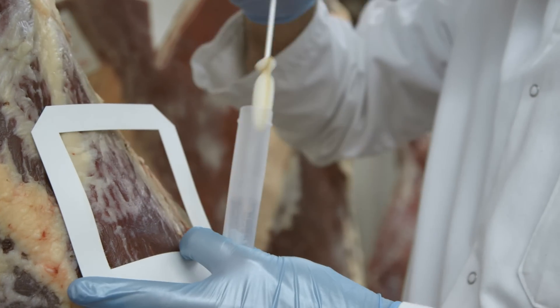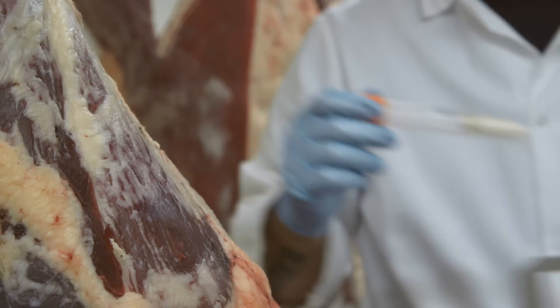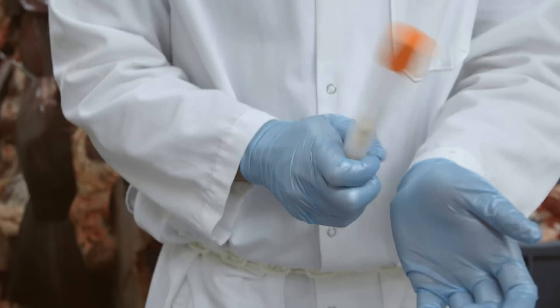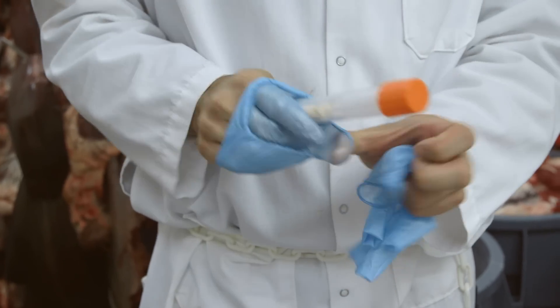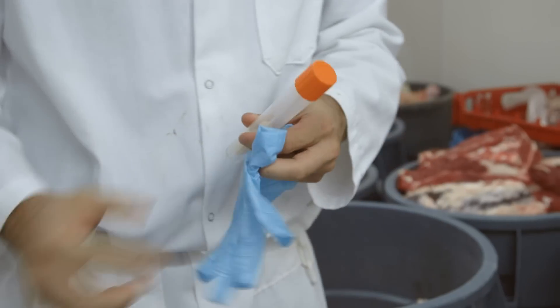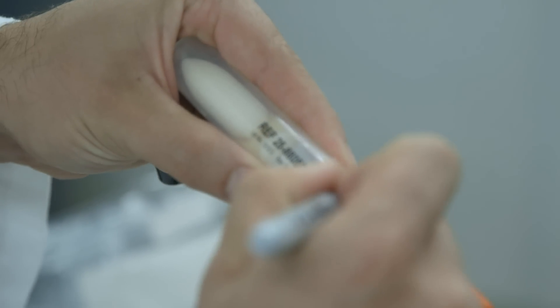Aseptically return swab into corresponding vial by turning clockwise until tension is felt. Remove and dispose of gloves properly. Label vial with appropriate information.